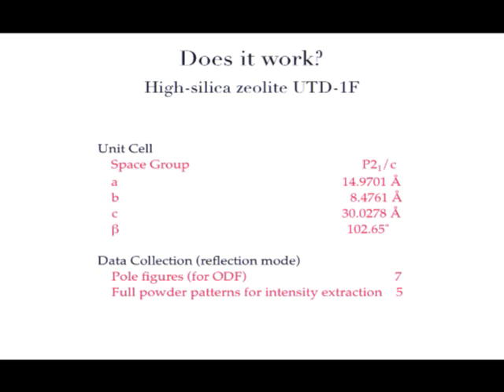So, question, can I do deconvolution of the overlapping peak? Does it work? Well, we used the sample as a way to prove the principle of zeolite UTD1. It is a fairly complex zeolite, has a relatively large unit cell.